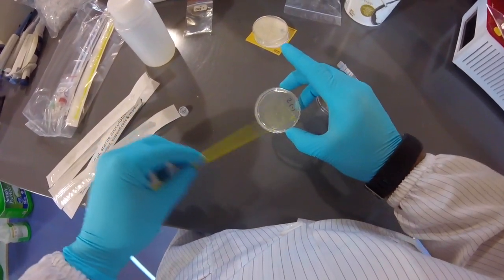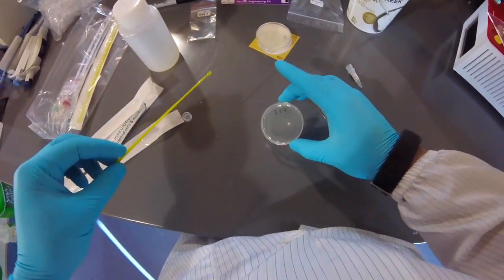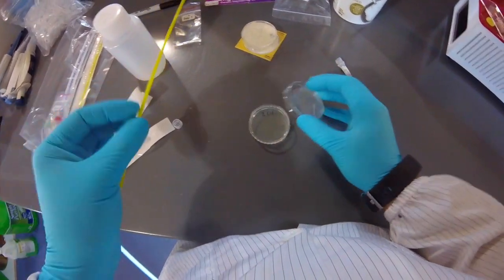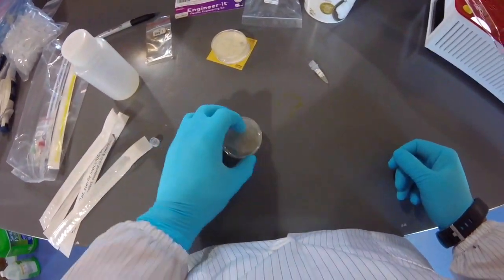And I'm just going to drag this all the way across like that. Make sure you get cells on there, okay? There should be no question as to whether the antibiotics work or not. So let's put lots of cells. All right, and then that goes in the container.